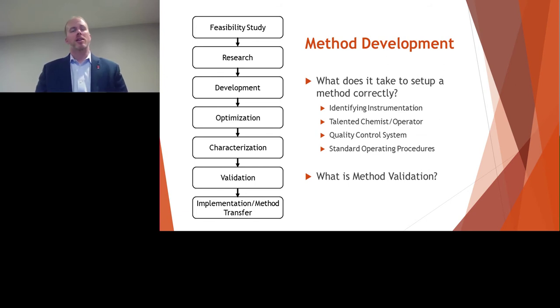So can they pick up new instrumentation? Do they have a broad scope of methods, particularly if they're a liquid chromatography individual? Do they also have some background in GC, or would they have some ability to do microbiology? So look for the individuals, depending on how large your lab is and what kind of equipment that you need, what their capabilities are.